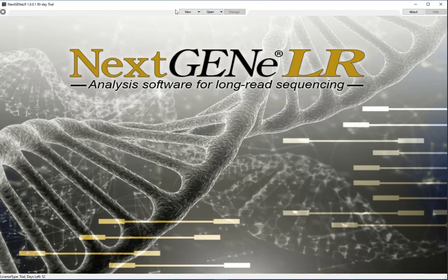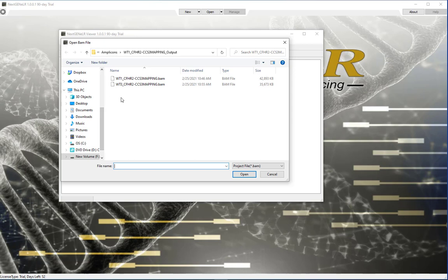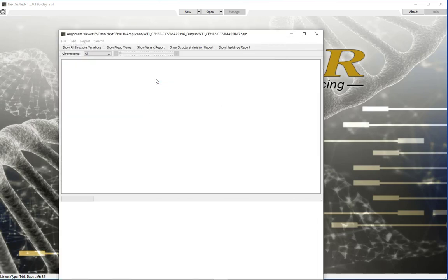The second option is to click the Open button to open the viewer, then go to File > Load BAM. Browse to and select the BAM file saved by NextGene Elahar for the sample. This is found in the output folder where the project.pjt file is also saved.